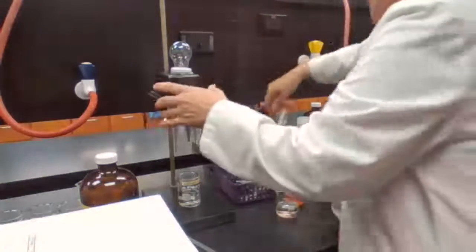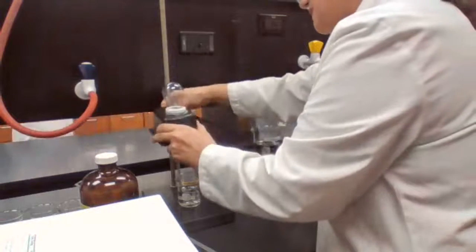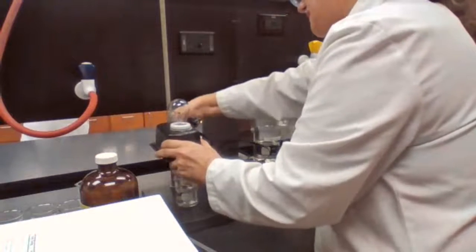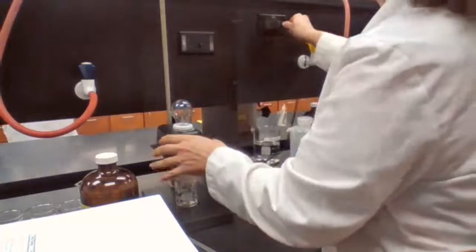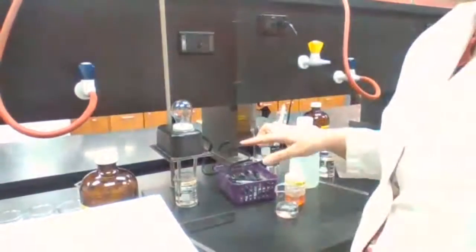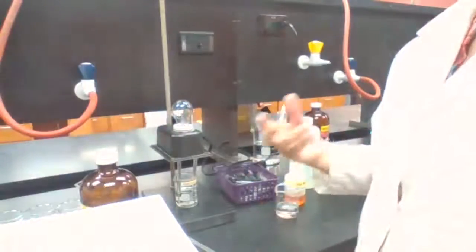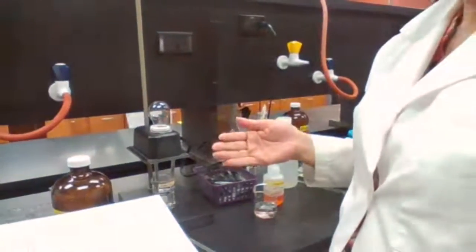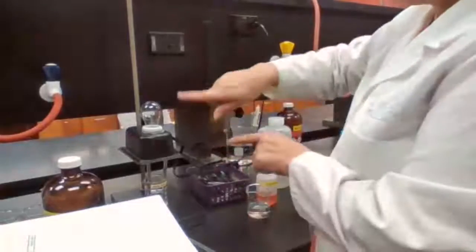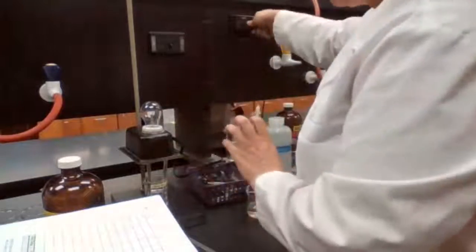Okay, with the glacial acetic acid, we are going to see if it's going to conduct electricity or not. So glacial acetic acid means pure acetic acid with no water, no ions. So acids do not act as acids unless they are inside the water. So glacial acetic acid would be non-electrolyte.